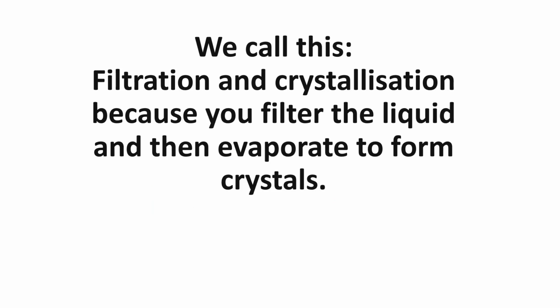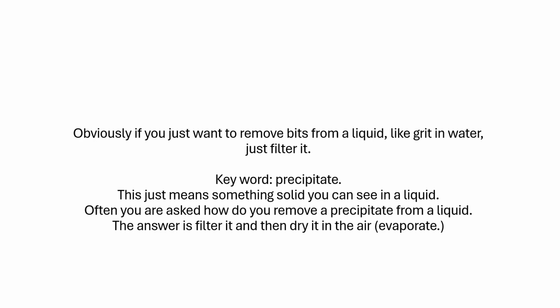Now, we call this filtration and crystallization. So obviously it's called filtration because you filter it first, and crystallization because they become crystals at the end. So you filter the liquid, filtration, and then you evaporate off to form crystals, crystallization. Obviously, if you want to remove bits from a liquid, like grit in water, you filter it, filtration.